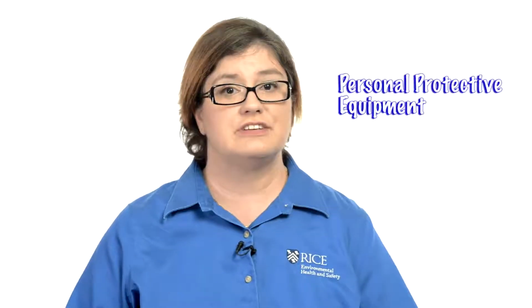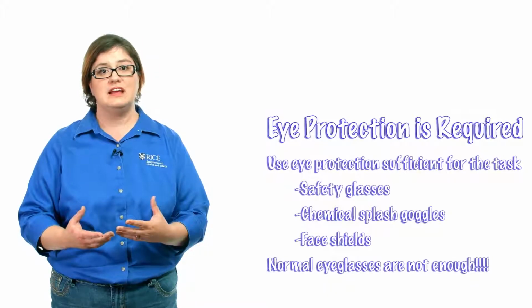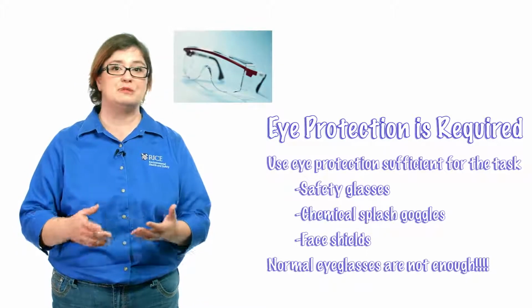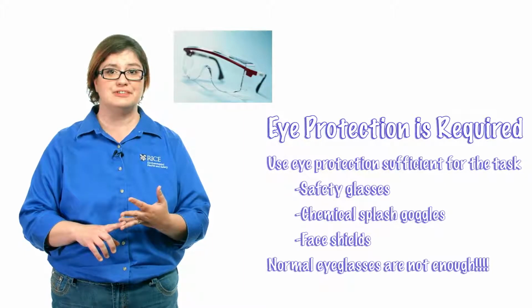The last part of minimizing the risk that we need to talk about is going to be personal protective equipment, or PPE. The first and probably the most important type of PPE that you need is going to be eye protection. When working in the laboratory, you want to be sure and have eye protection on. Whenever you're working in a laboratory of low hazards, most of the time you can utilize safety glasses because they're going to provide impact resistance and some side shielding from splashes.